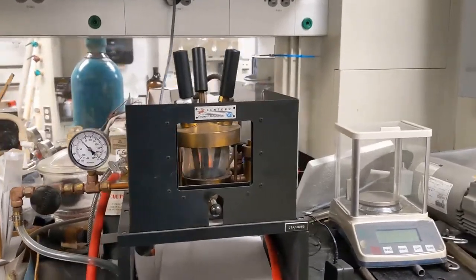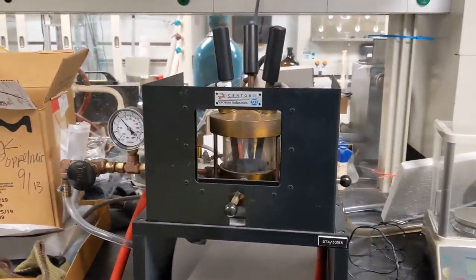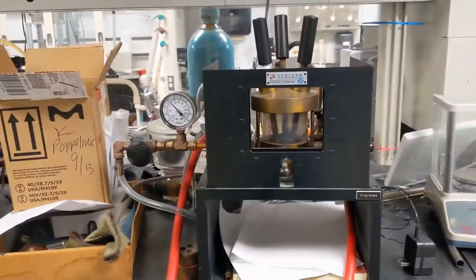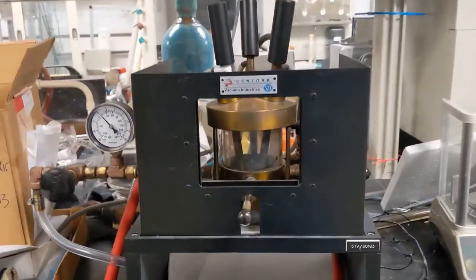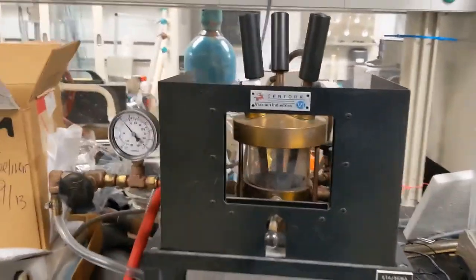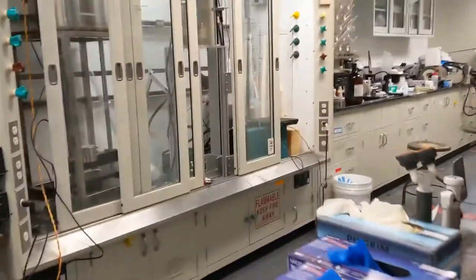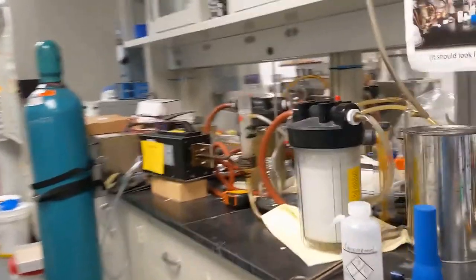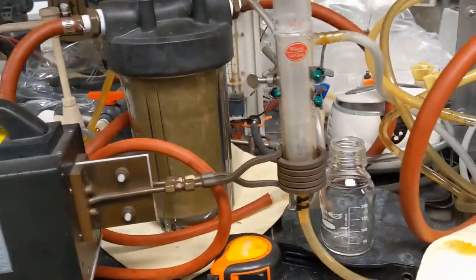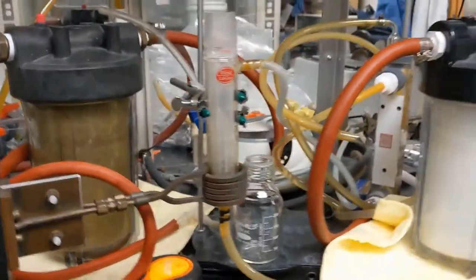In addition to our furnaces, which typically reach 1,200°C, we have two high-temperature instruments. Here's an arc melter, which literally uses electric discharge to melt materials up to temperatures of around 3,000°C. Similarly, we have an induction furnace, which uses magnetic coils to heat your sample up to 2,000–3,000°C.